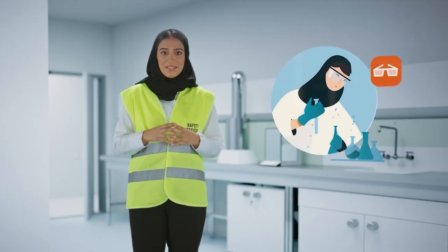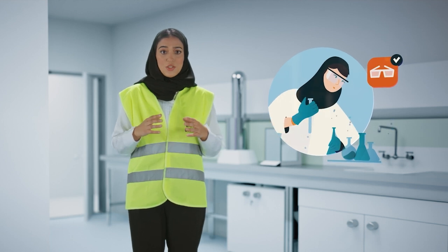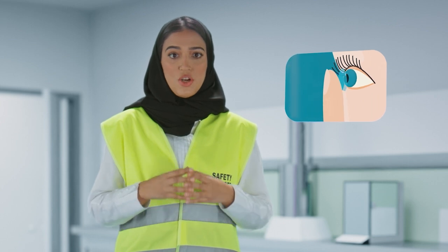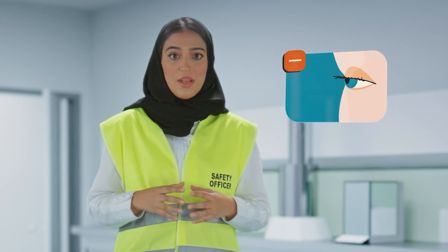Safety goggles must have integral side protection to protect against splashes. If you wear corrective lenses for your vision, please note that contact lenses are not suitable. They do not provide any eye protection and must not be worn in our laboratories. Prescription glasses are not suitable for safety glasses and must be covered with over-safety goggles.